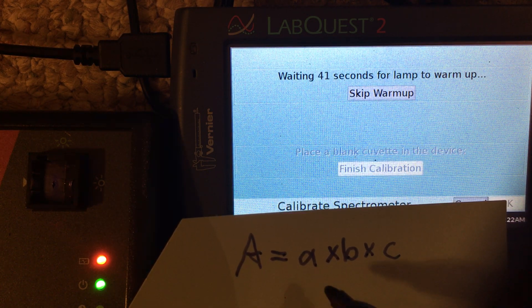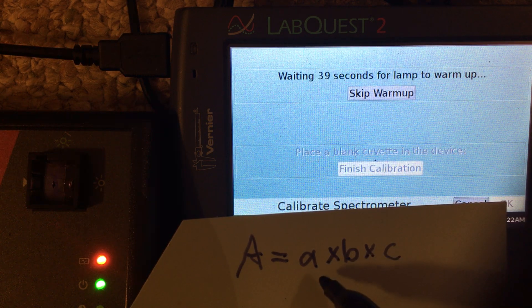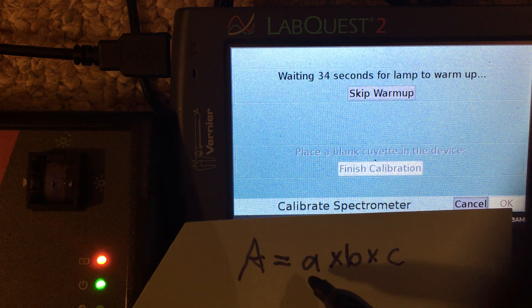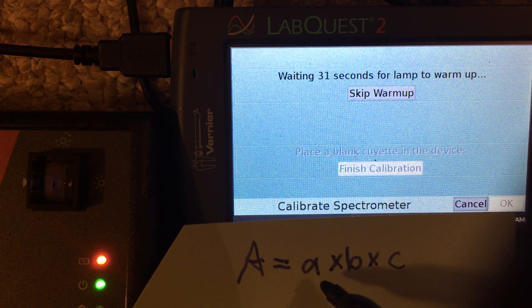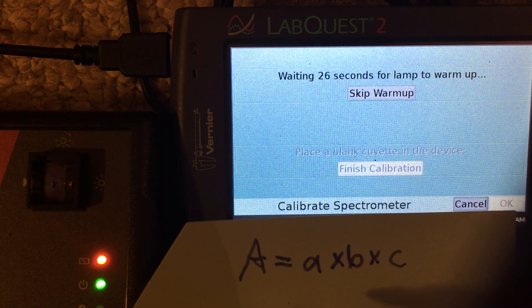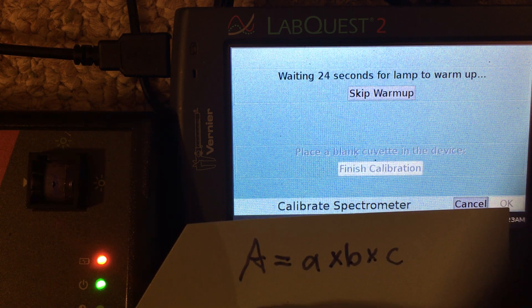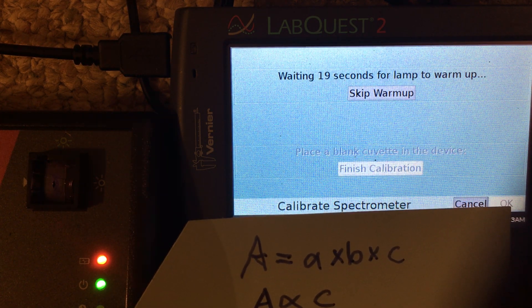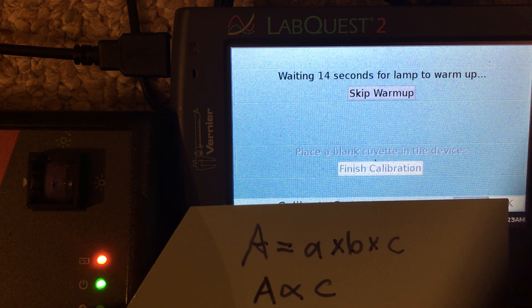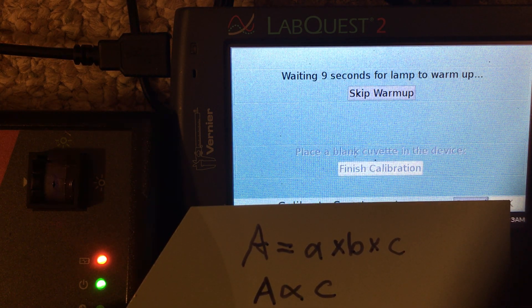A and B are going to be constant for these measurements because we're using different concentrations of the same molecules in solution, and the path length will remain constant. The cuvette has a one centimeter path length, so essentially absorbance is going to be linearly proportional to the concentration C — and that's the basis of producing this calibration curve. It's important to remember that this works best if the absorbance values you're using are less than one.